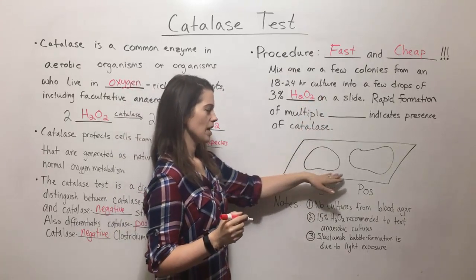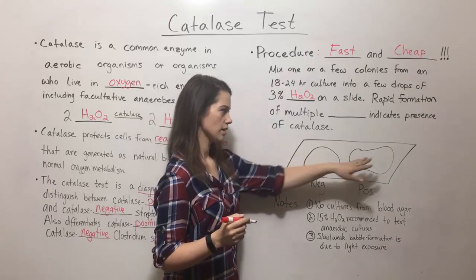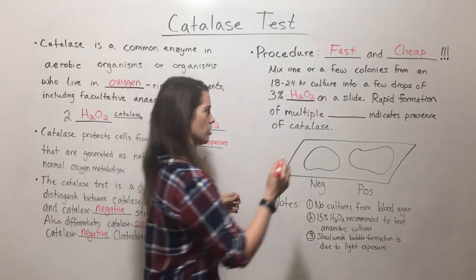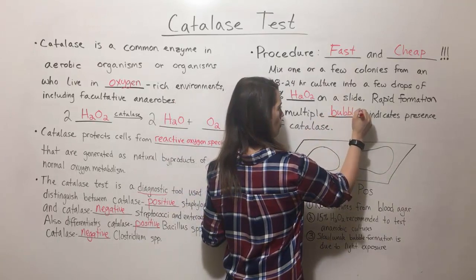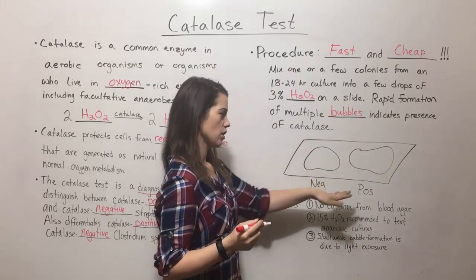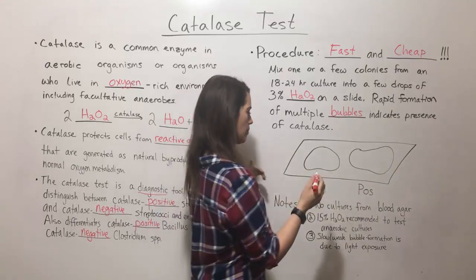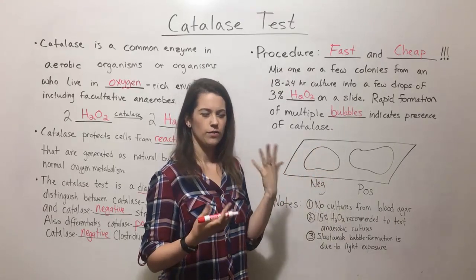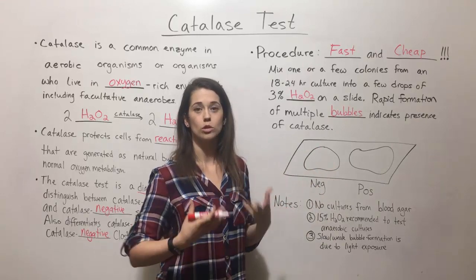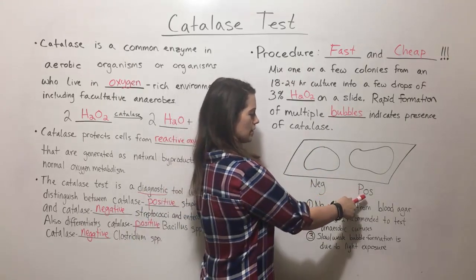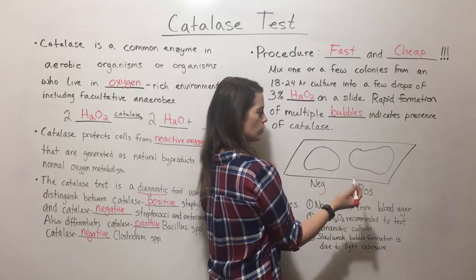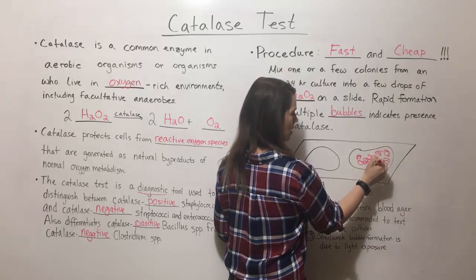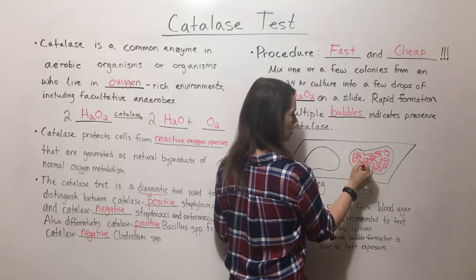So here we have a slide, and here we have a few drops of hydrogen peroxide. If you have rapid formation of a large amount of bubbles, that means you have a catalase-positive organism. If a catalase-negative organism is added to the hydrogen peroxide, you won't see any bubbles form, or if there are any bubbles they'll form slowly and it'll be a very weak reaction. Whereas if it's a catalase-positive organism, you're going to see really rapid formation of lots and lots of bubbles.